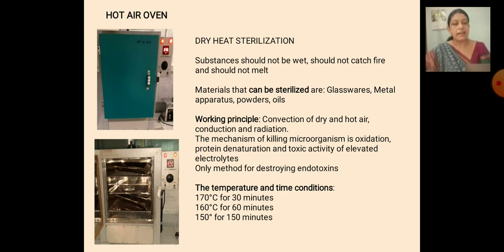After air drying, wherever there is an opening, for example in test tubes and pipettes, they are plugged with cotton and then kept for sterilization by dry heat in the hot air oven. How are they kept? Either they are wrapped with paper like brown paper, or wrapped with aluminium foil, and are stored in the various racks.